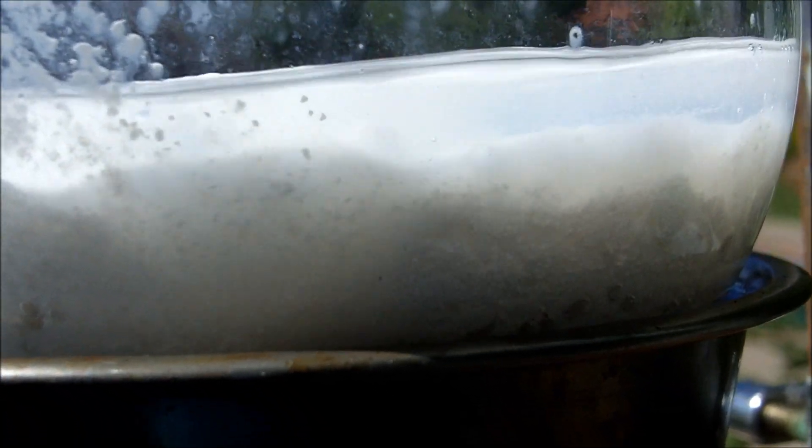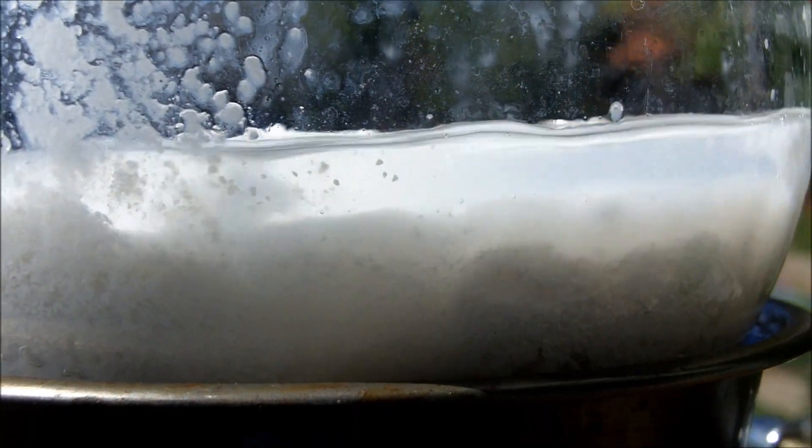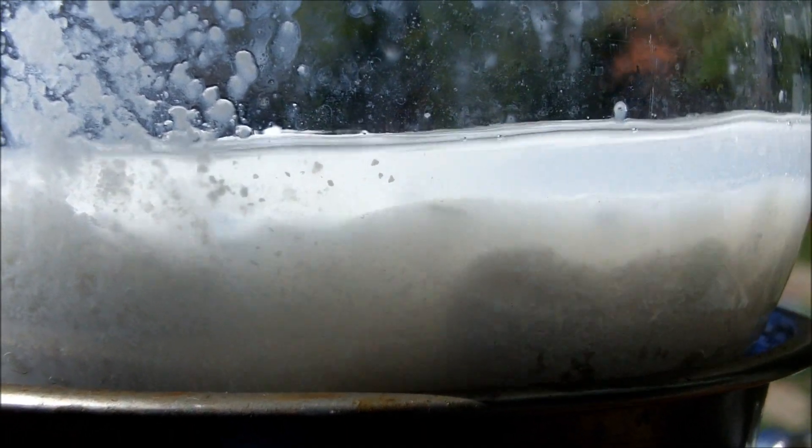After distillation we'll be left with two layers, the bottom layer being chloroform. Even as it's boiling you can see the two layers separate in the round bottom flask. So after that's all distilled over, I'll separate them out.